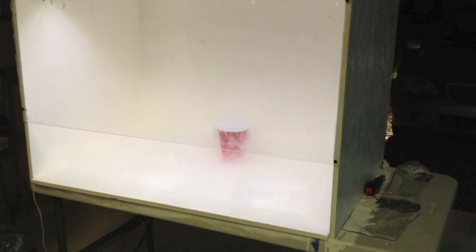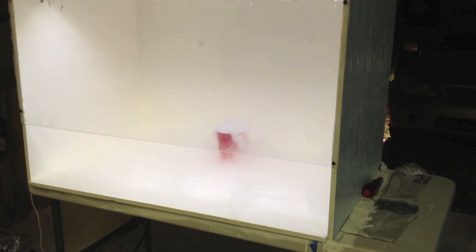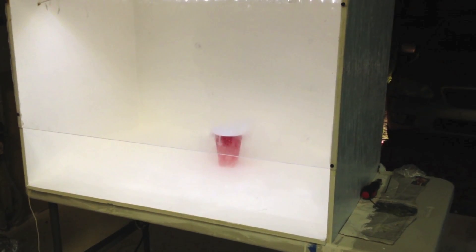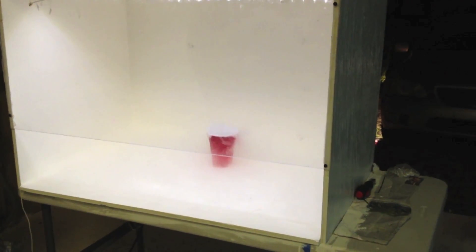Eventually, we're going to hook this to the back of the garage so that the fumes are blown directly out of the area. I'll post the specifications of this hood in the video for those of you who want to build your own, because it did take a while for me to figure out how I wanted to do this. But now I can just show you how I did it, and hopefully that'll work for you.